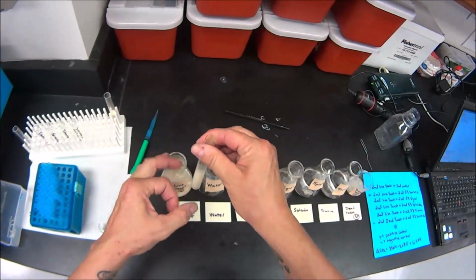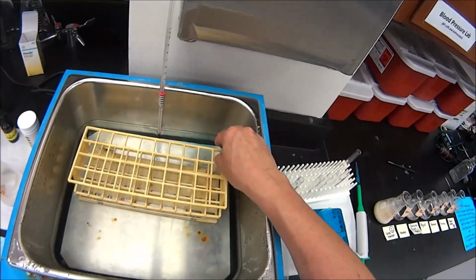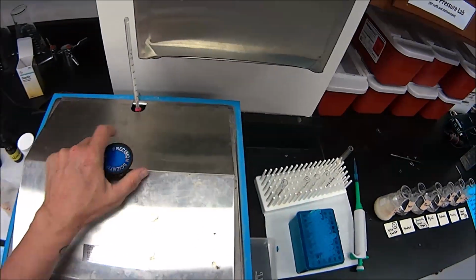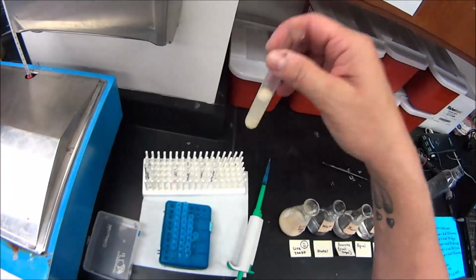We're going to mix, mix, and then we're going to put it into a water bath that is set to 37 degrees. And we're going to set our timer for 5 minutes. Fooled ya, time warp. I've already made some up.